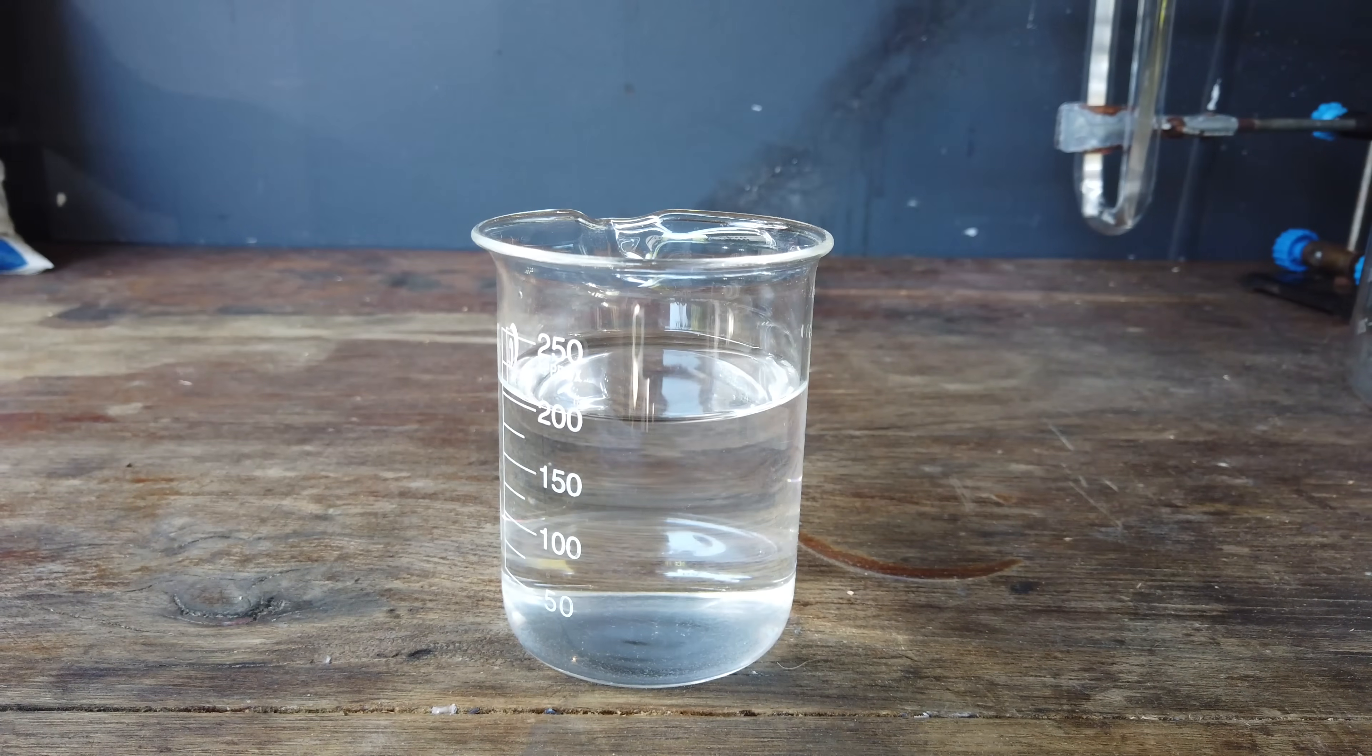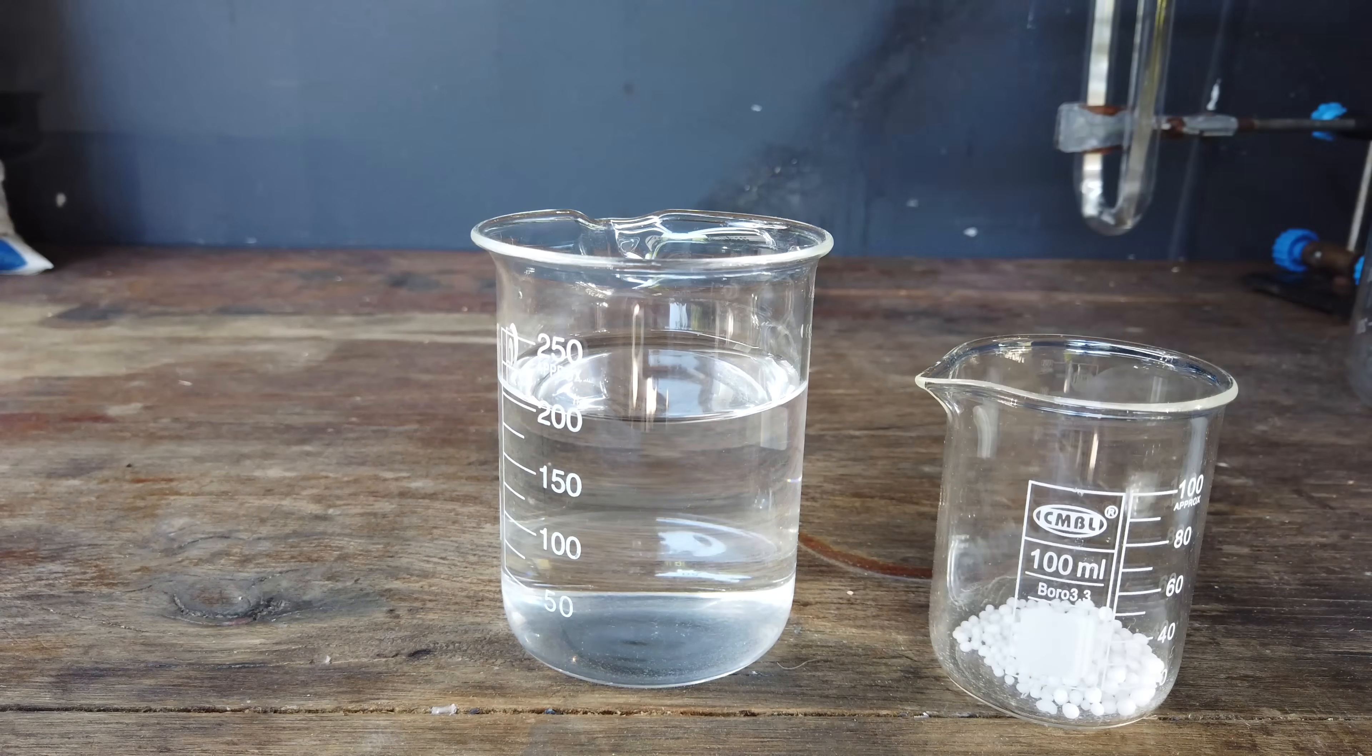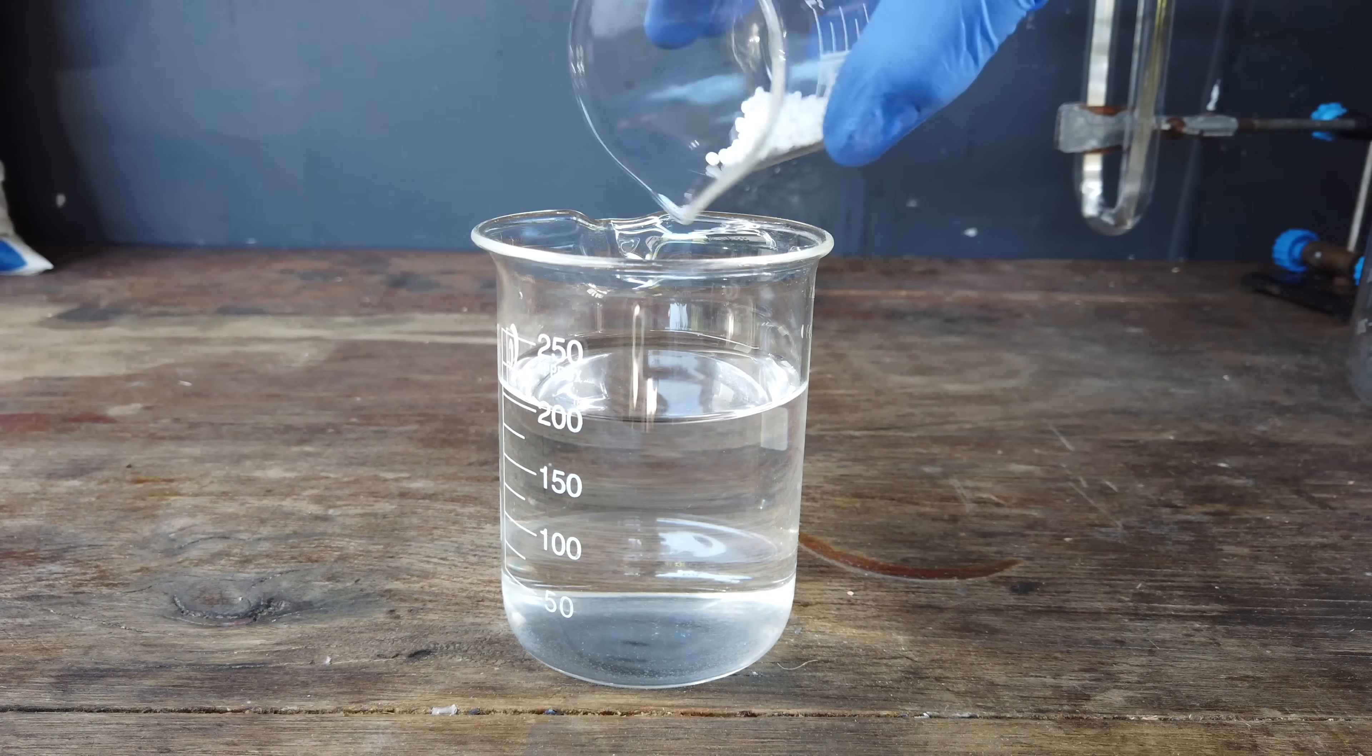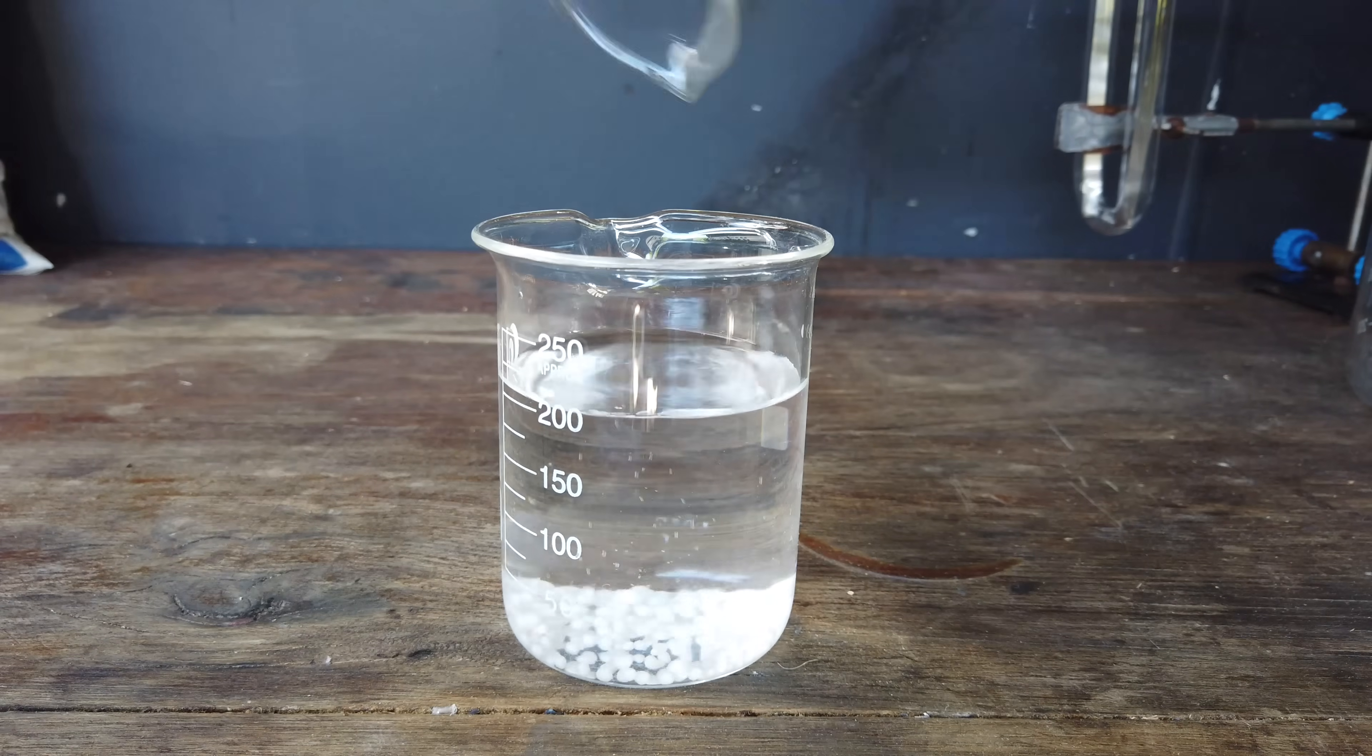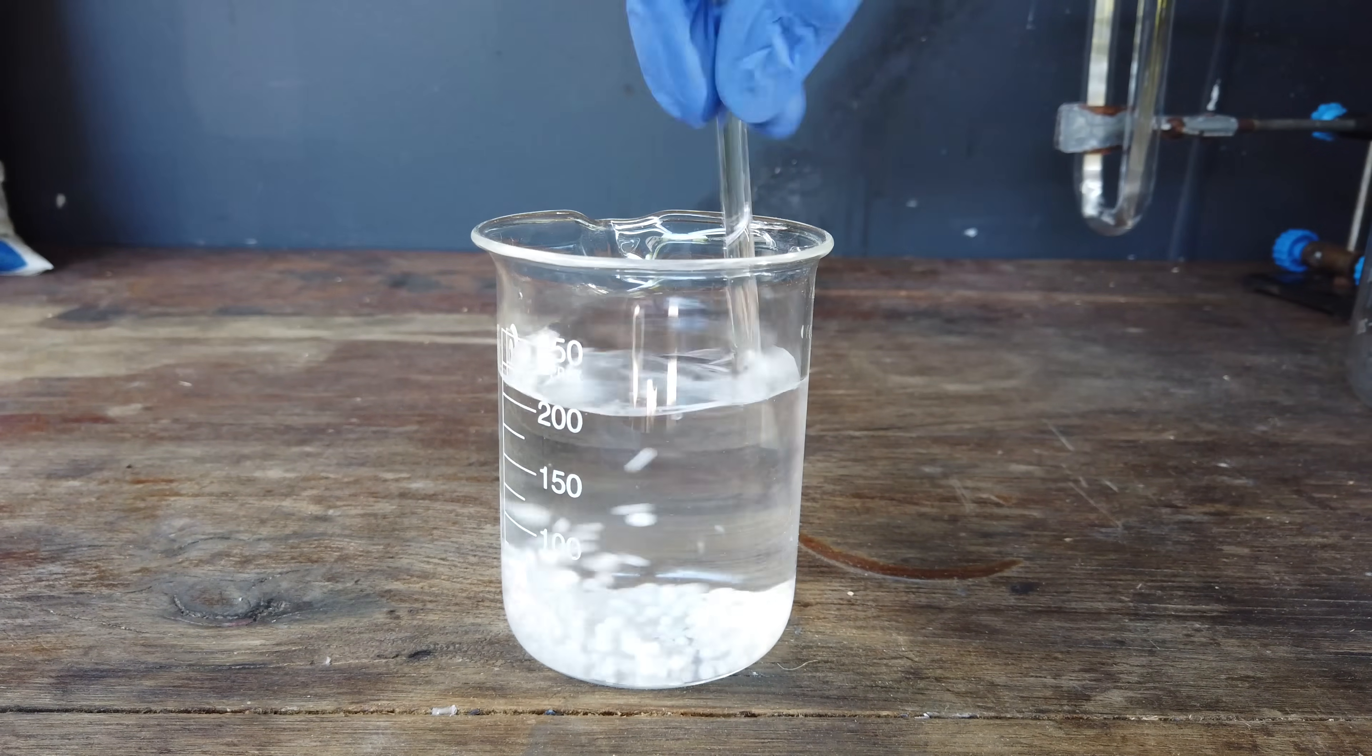To get our urea ready for electrolysis, I have four grams of urea right here and 200 milliliters of distilled water. All we need to do is just dissolve that up in distilled water there. That might take a little while to dissolve.